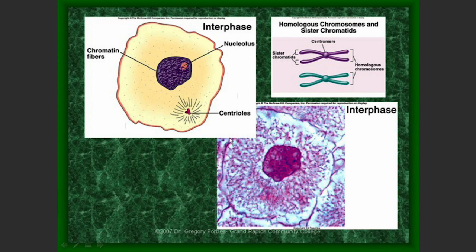Let's take a look over here. Here's our cellular, also known as the plasma membrane, and here is the nuclear membrane. So we can see the corresponding structures between the illustration and the photograph. Now, if we take a look inside the nucleus, what we have in here is what's labeled as chromatin fibers. Chromatin fibers represent the chromosomes that haven't condensed upon themselves.